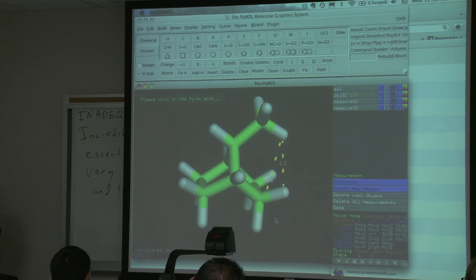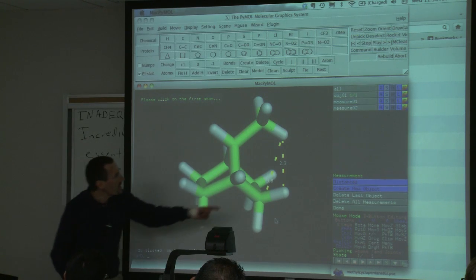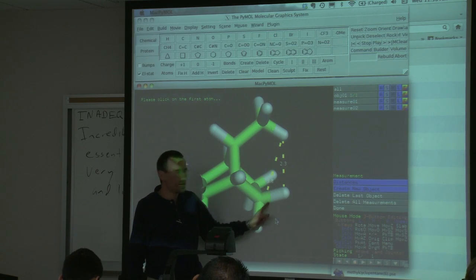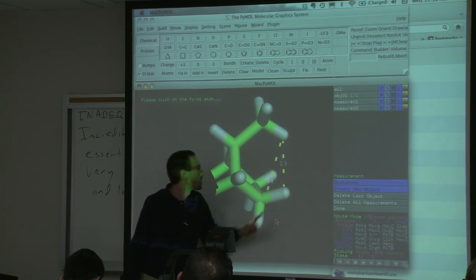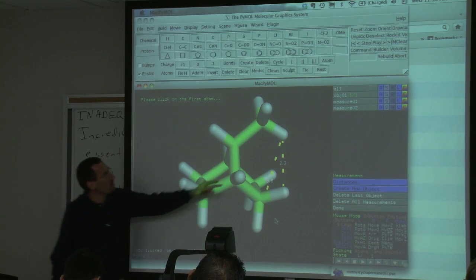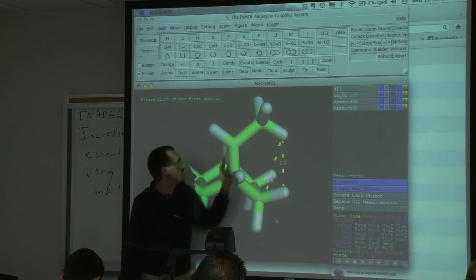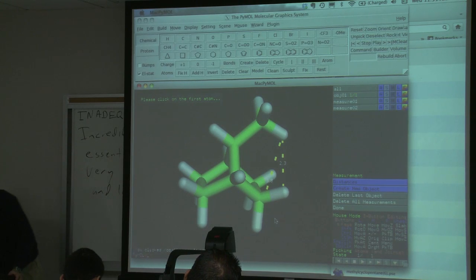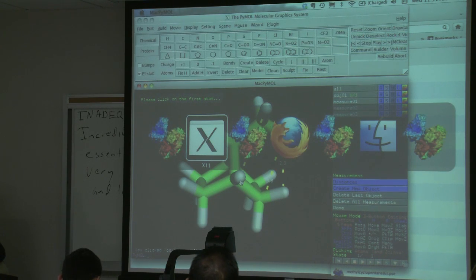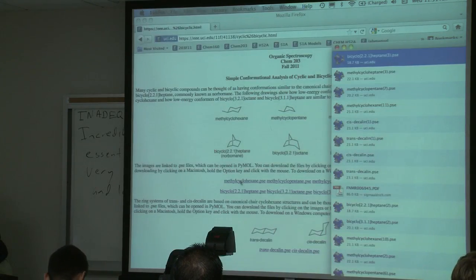And you'd be able to look and say, okay, by golly, a cis distance is going to be a nice strong NOE. A trans distance is going to be a much weaker NOE. It also helps you calibrate. So remember, we were dealing with a methylene or a hydrogen off of there, and you can start to say, oh yeah, I can begin to think about these types of distances as well. So that's why this is so integral to understanding stuff.